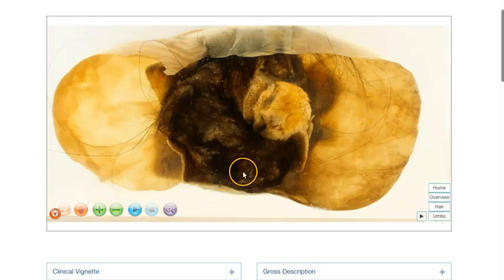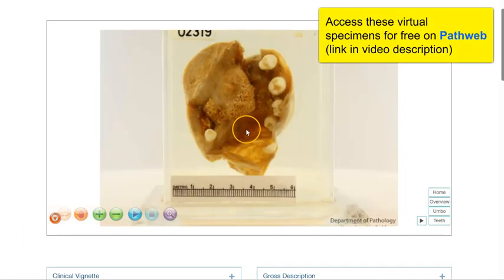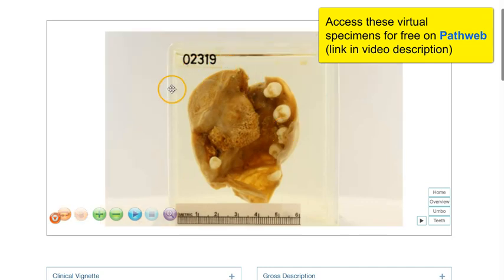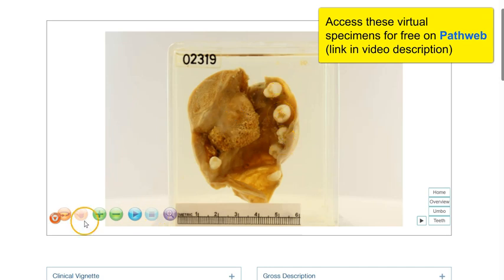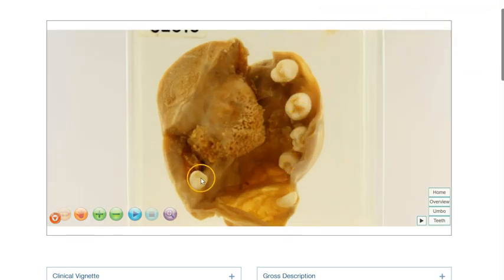Let's look at another example of a mature cystic teratoma. What is very obvious in this specimen is the solid area or the umbo, as well as the presence of very well-formed teeth. So we can see these teeth.